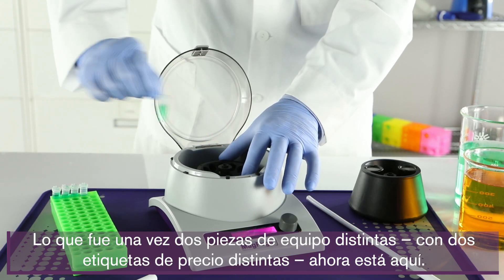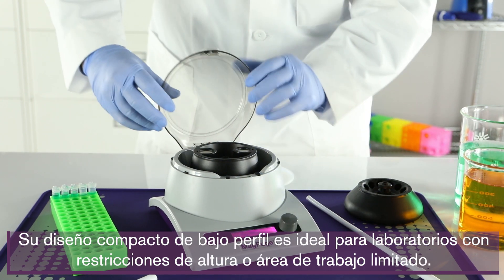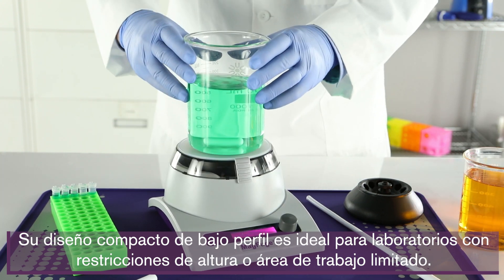What was once two distinct pieces of equipment with two distinct price tags is now all right here. Its compact low-profile design is ideal for labs with height restrictions or limited bench space.